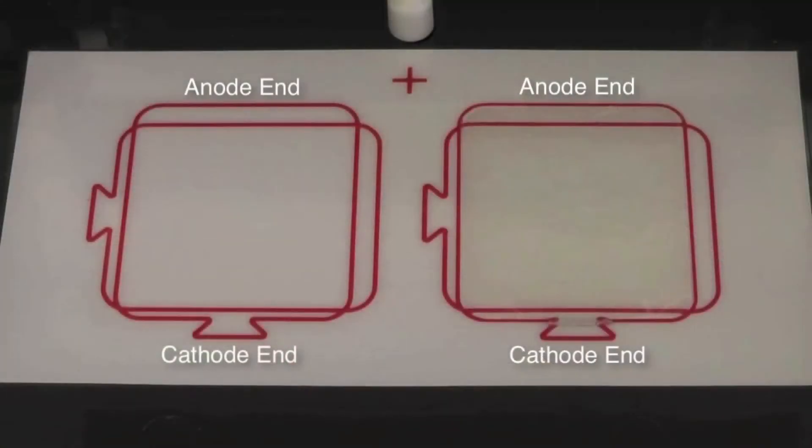With a tweezer, lift the thin plastic protective film on the gel. The gel has an anode end and a cathode end. The cathode end of the gel is indicated by the protruding plastic tab.